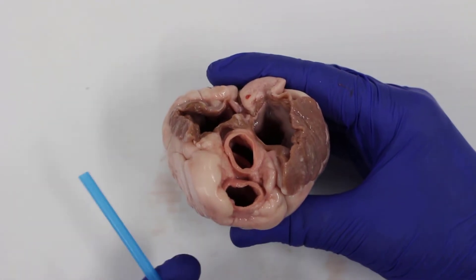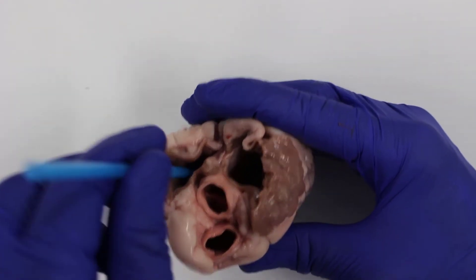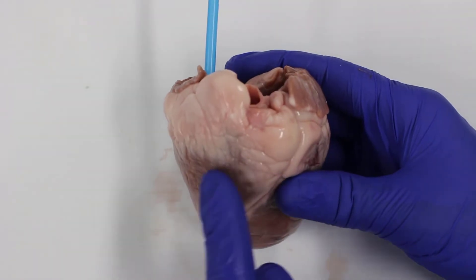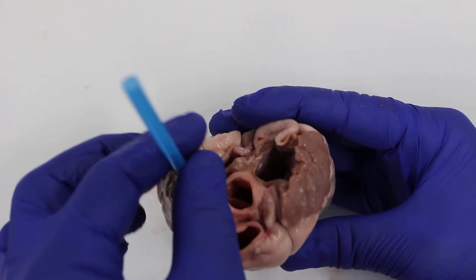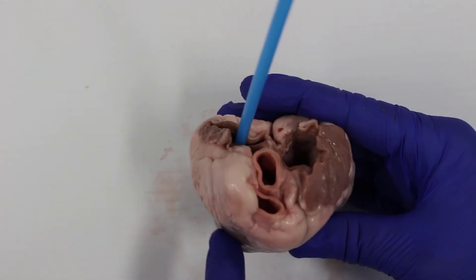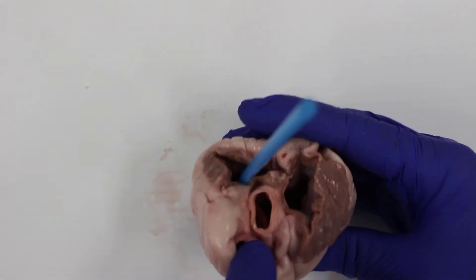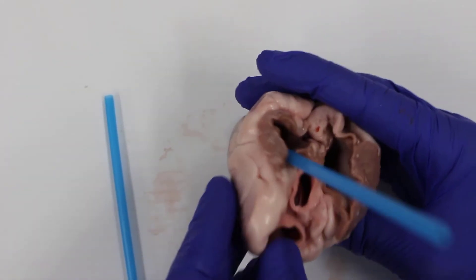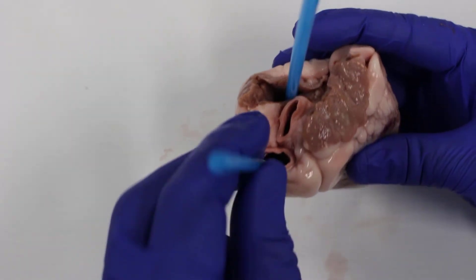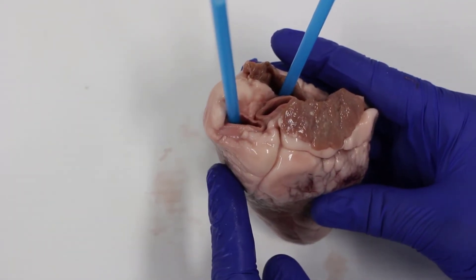We use a blue straw because blue represents deoxygenated blood — blood with less oxygen in it, because it's come back from the body after the cells have taken the oxygen. It goes through the vena cava into the top part of the right side of the heart, the right atrium. The right atrium squeezes and the blood goes down to the right ventricle, then gets pumped through to the lungs via this vessel here — the pulmonary artery.